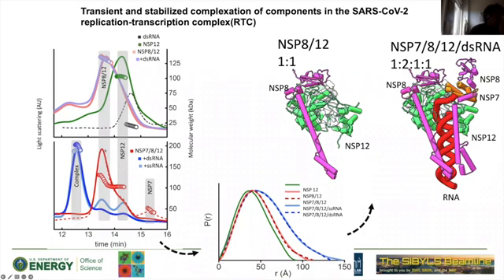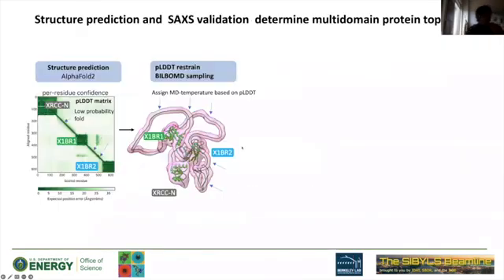But obviously, to model this SAXS data, match it to the cryo-EM structures and find out the transient complexation and what is important to the assembly of this large transcription complex, the SEC-SAXS allowed us to do it, because we separate all those non-complex states, like you can see here from the complex. We still have pieces of non-complex states in the sample. This is an example of where we go.